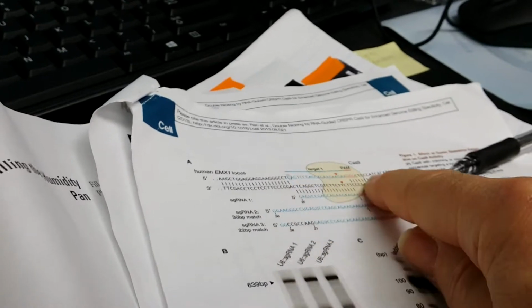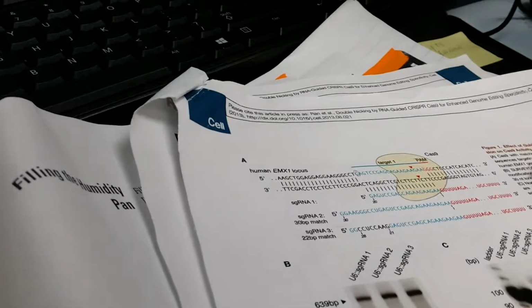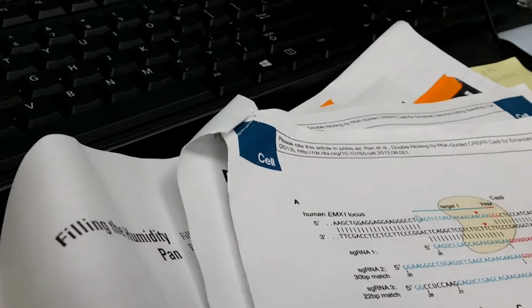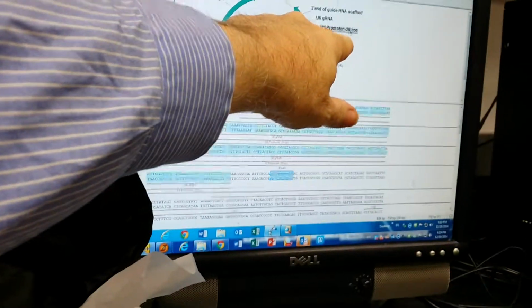And the RNA will just be this little bit because of that SP6 promoter, right? Or U6. What does U mean? I think it's a constitutively expressed promoter. And this is at minus 20. It says minus 20.